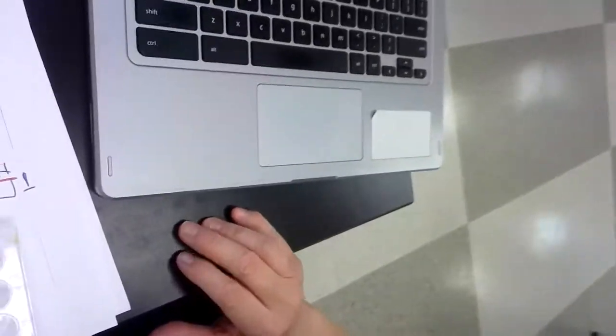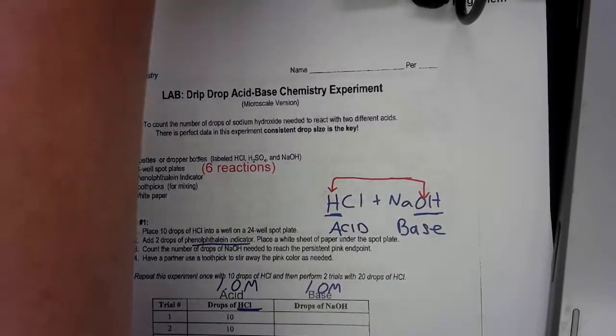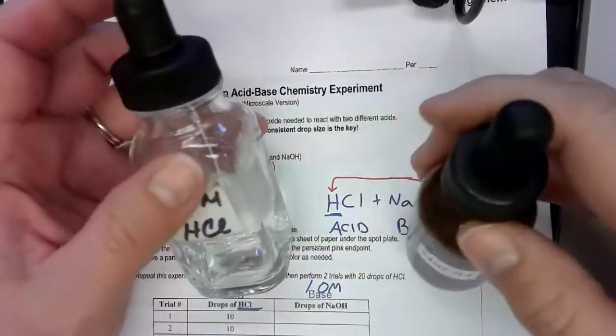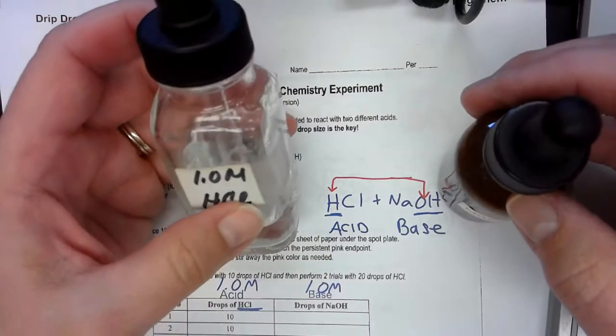Hi, just wanted to do a video to show you about this lab. Okay, got my goggles on and it's called the Drip Drop Lab, acid-base chemistry. We're going to use HCl and we're going to use NaOH, and HCl is an acid and NaOH is a base. And we're going to be looking at the balanced equation of them.